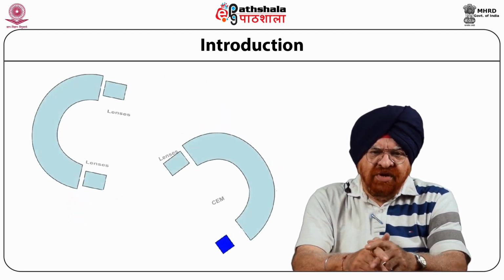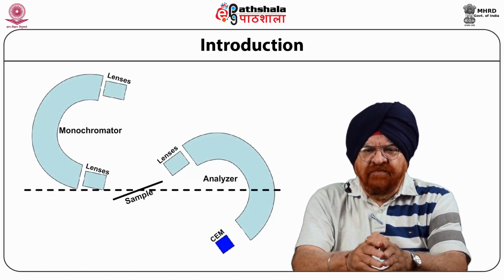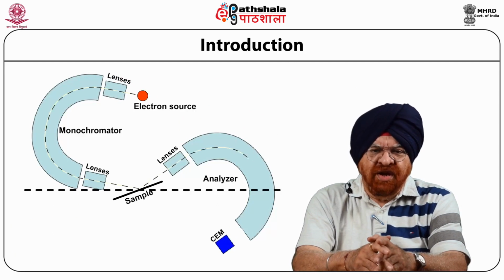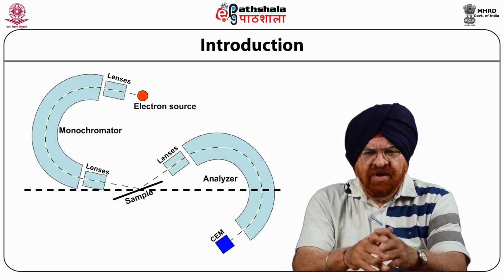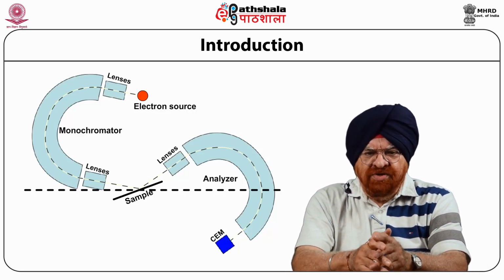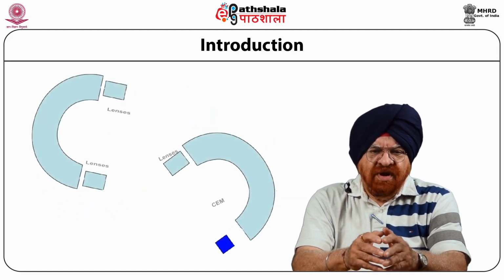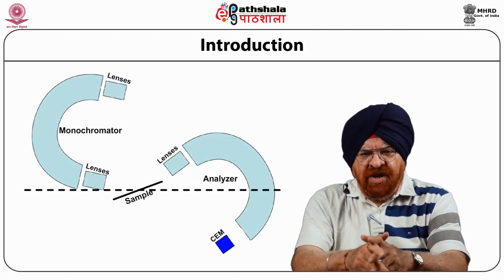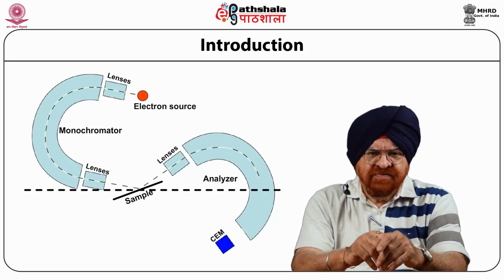When we come to introduction, in this spectroscopy, the electrons are backscattered from a sample surface where they undergo inelastic scattering processes, and this is what we have highlighted in the earlier slides in great detail. The primary electron energies used in HREELS are quite low, so low that often it is in the range of 10 electron volts or lower for that matter.